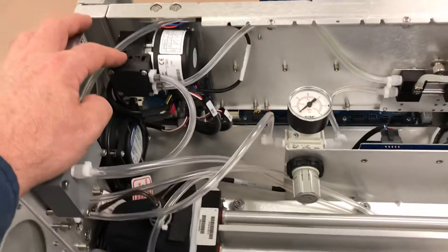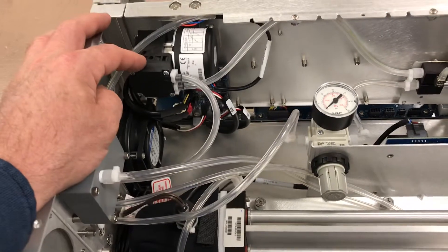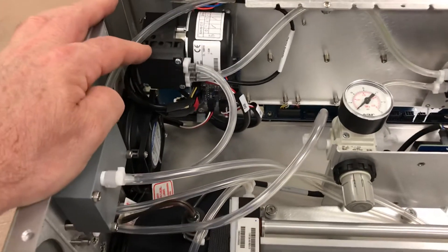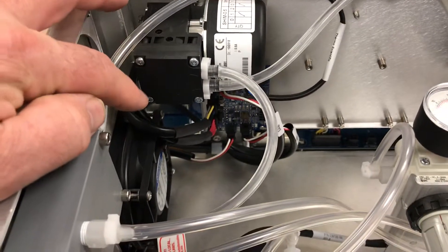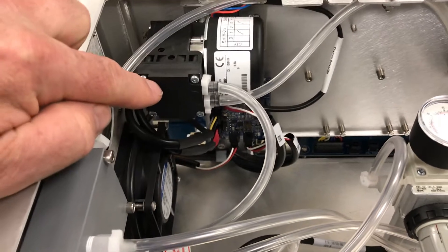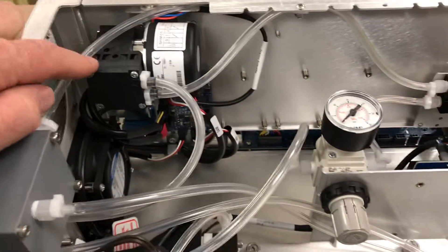DC pump — they've gone away from the AC powered pumps that generated a lot of vibration and heat. Now they've gone with these quiet, low-heat DC powered pumps. They're easy to maintain because it's just four simple screws to get out the diaphragm right underneath this panel, so it's easy to do a pump rebuild in the field.